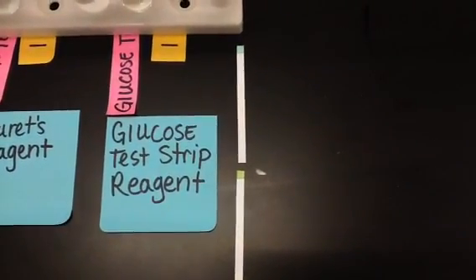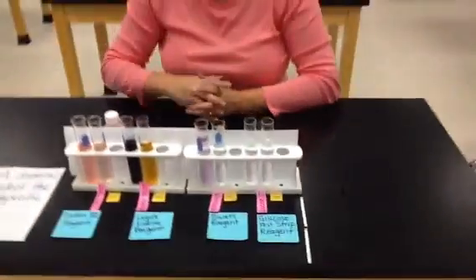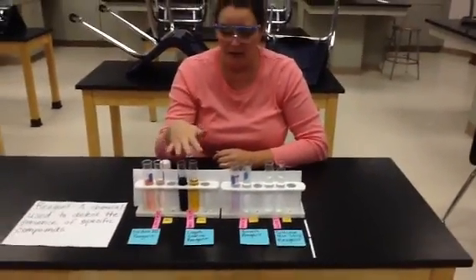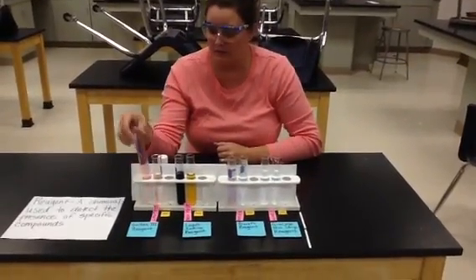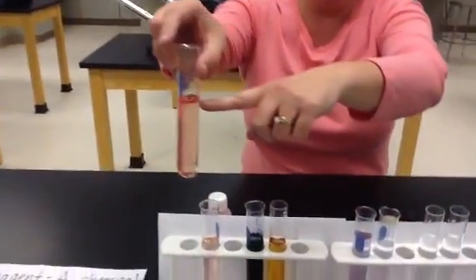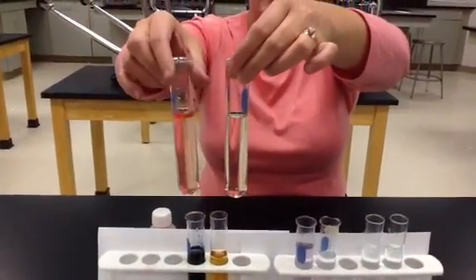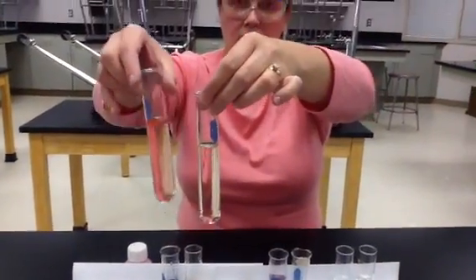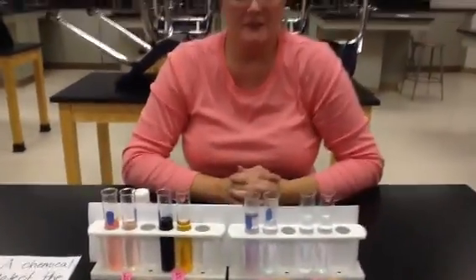So you guys are actually going to test for your own unknown solution and find out what's in it. Do you have lipid in it? Do you have starch, or protein, or glucose? Let's look back at our fat test. Notice how there's this layer right here, and there's no layer in here. That right there tells us that it's positive for lipid. And I look forward to doing this lab with you.